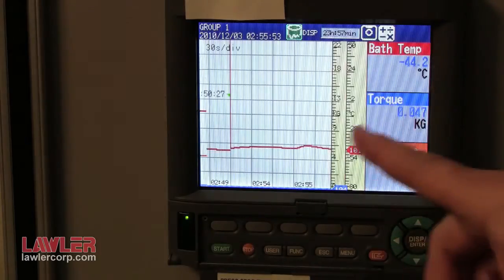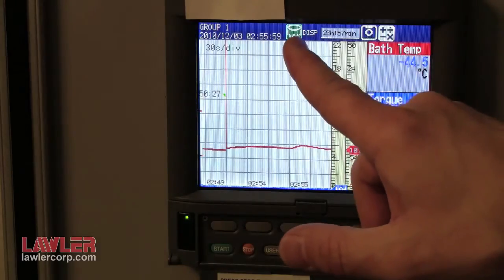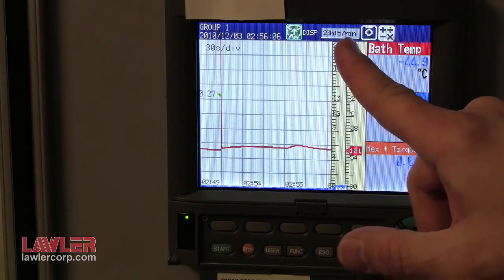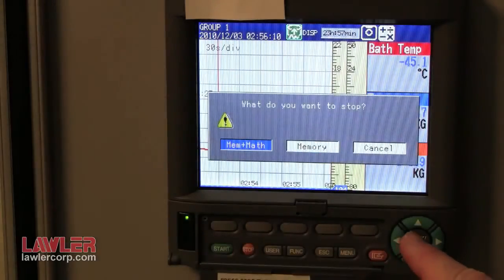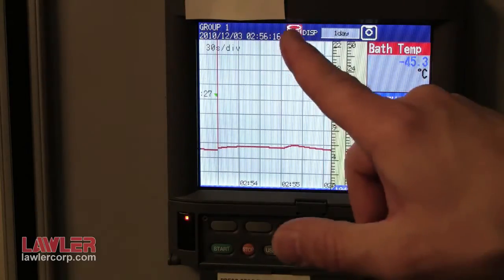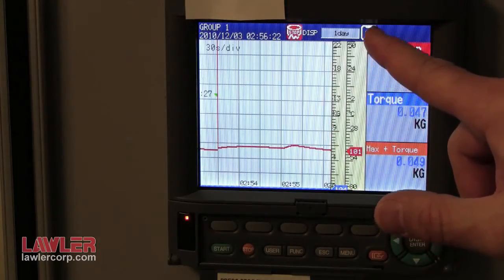For demonstration purposes, the system is not set up right now, but you can see the different values. The green icon indicates that the unit is recording. There is a horizontal bar graph that indicates the available memory. To stop recording, just simply press stop, hit enter, enter, and the data is saved to a compact flash memory card. The indicator icon changes to red. As the memory card fills up, the floppy disk icon will fill up.